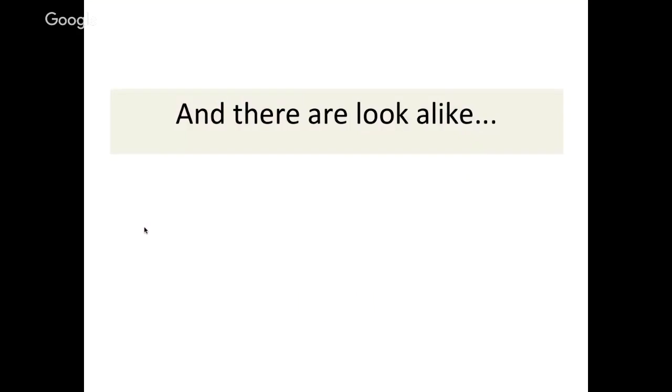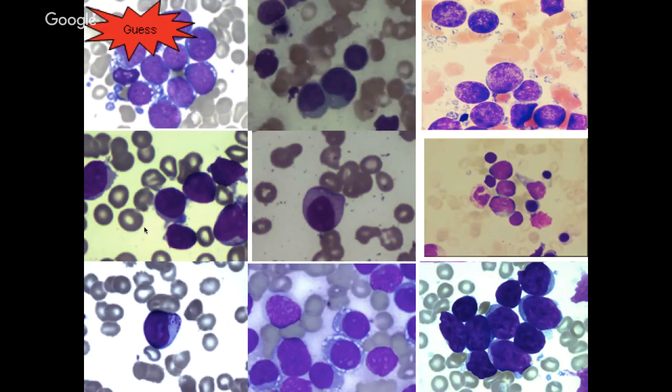And then there are many blasts which are mimics, but might not be blastic. I show you a picture of nine different cases. The one on the top left could be a Burkitt's, then in the top center could be an SLL, CLL, PLL. On the top right, it is a blastic mantle cell. Then down are hematogones, gamma delta T-cell lymphoma, granular ALL, DLBCL. It's difficult to subtype these cases. Few of them look blastic. Few of them look high grade.